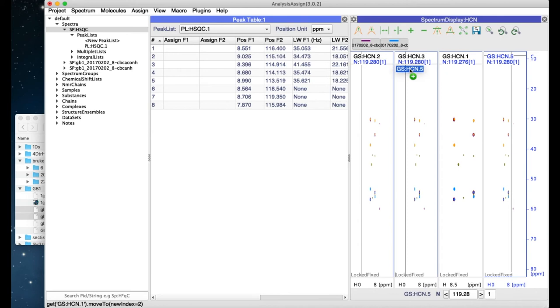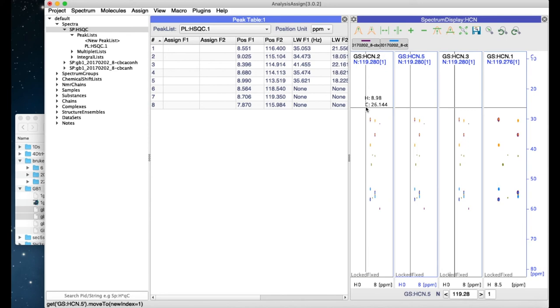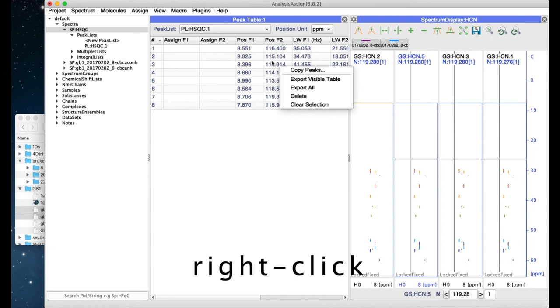The right-hand mouse menu is context-dependent, so it depends where in the program you click as to what the options will be. So just have a look and see what options you can find.